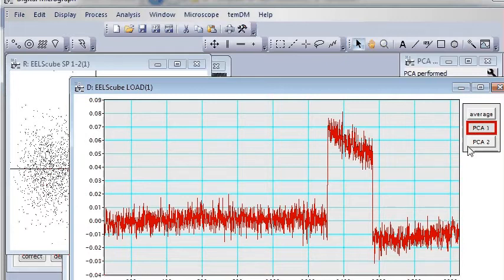Interestingly, this loading is now quite logical. It's different from what we had when we treated unclustered data. That's because we selected only one trend of variation inside our data cube, and now this variation can be readily picked, and it is actually quite logical.